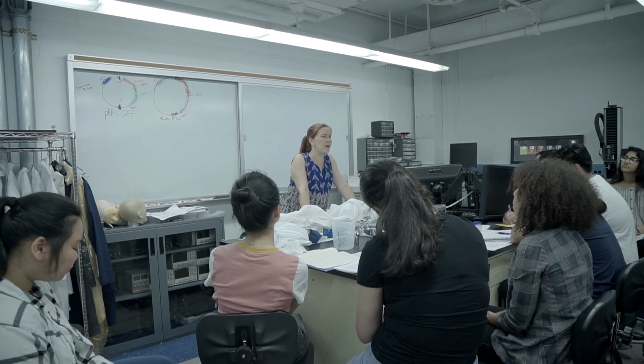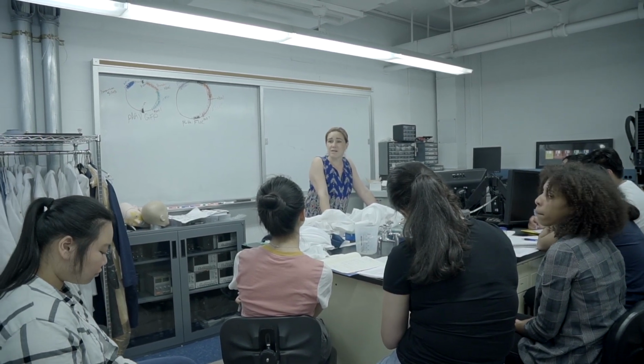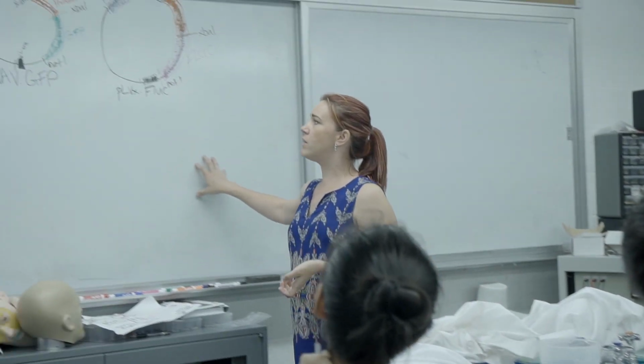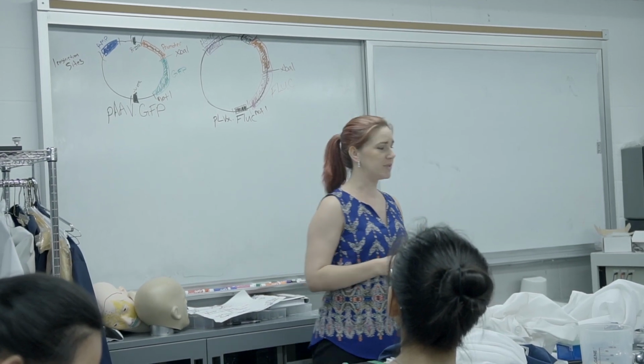So by a show of hands, has anyone ever done cloning or sub-cloning? You have, okay, great. So just one, that's excellent. And does anyone have an idea what the word cloning might mean? Maybe like making a copy of our DNA. Making a copy of a DNA, yeah, so making like a perfect copy, right? And the reason why we would clone is because we would want to make a whole bunch of copies of something that we're going to use.